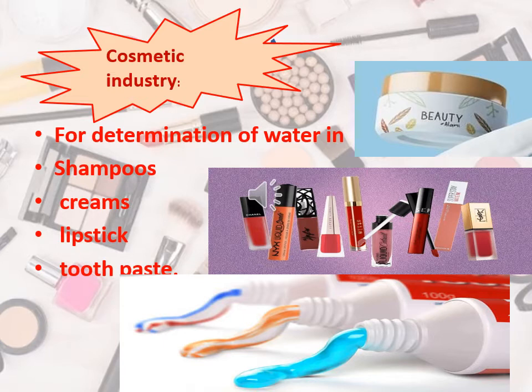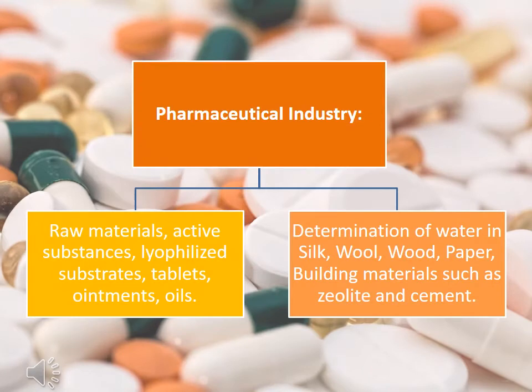Moving to the applications in cosmetic industries, it is used for the determination of water in shampoos, creams, lipsticks, and toothpaste. In pharmaceutical industries, it is used for the determination of water content in raw materials, active substances, lyophilized substrates, tablets, ointments, and oils, and also for the determination of water in silk, wool, wood, paper, and building materials such as zeolite and cement.